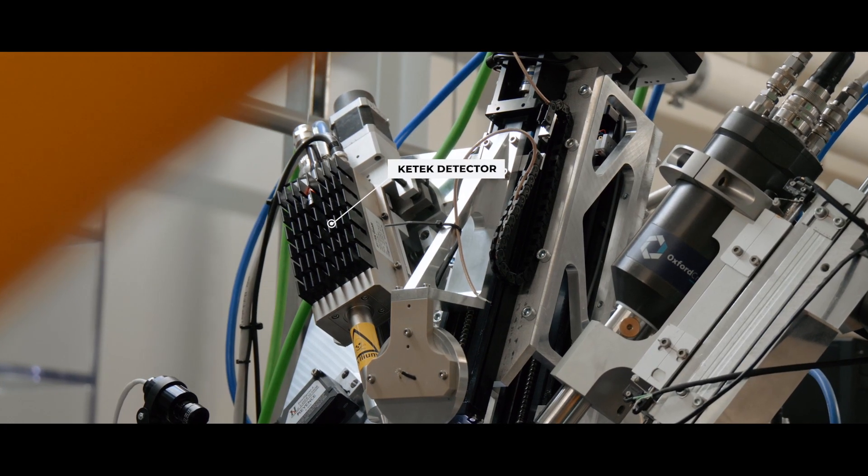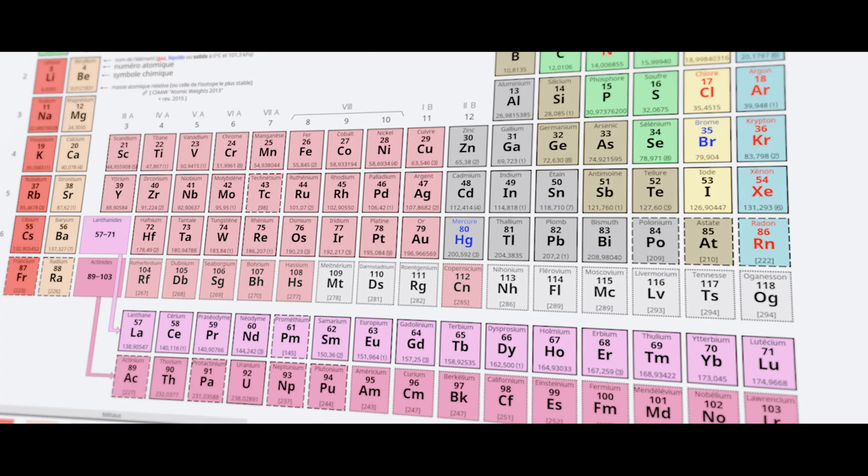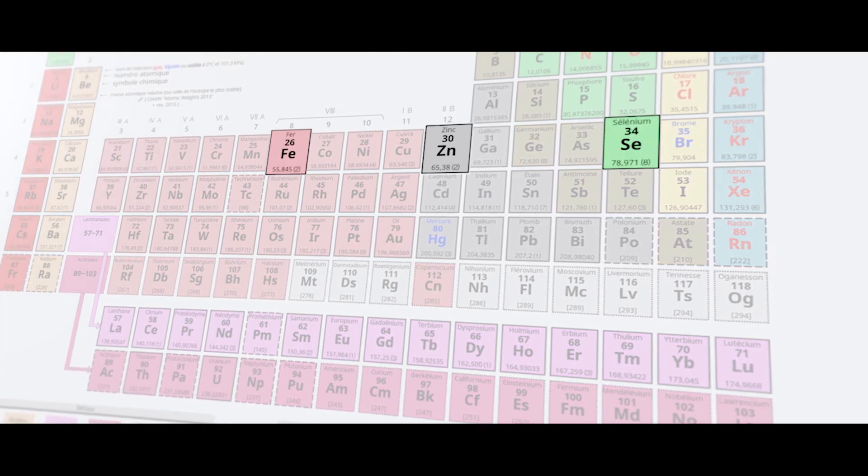In addition, a Ketek detector allows us to do fluorescence spectroscopy on heavy elements such as iron, zinc, selenium or lanthanides.